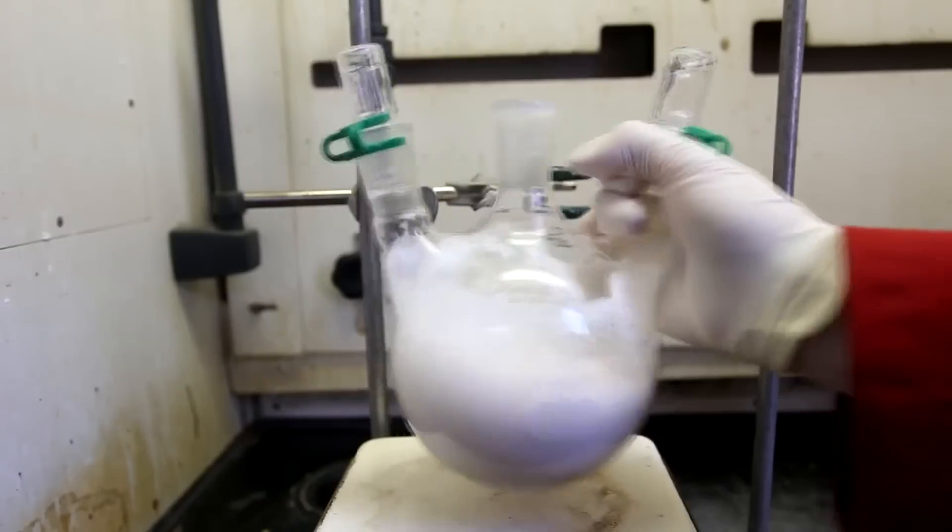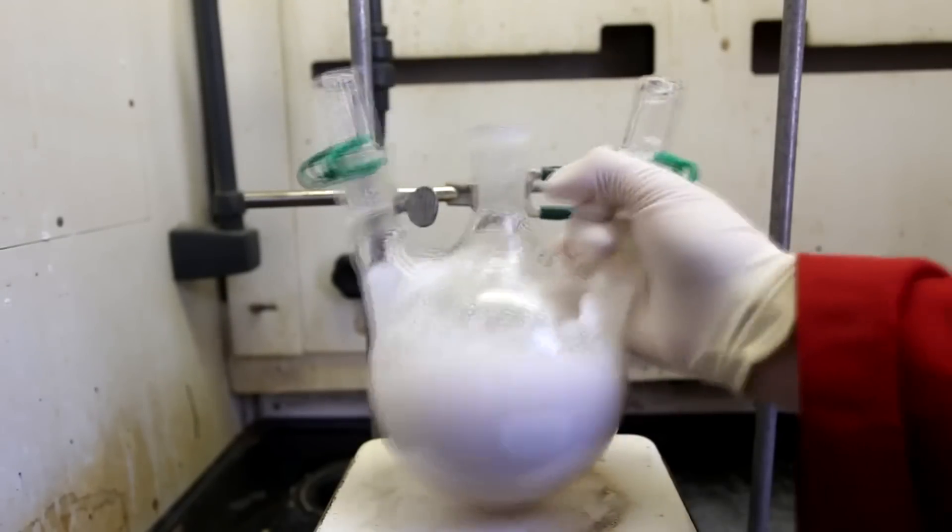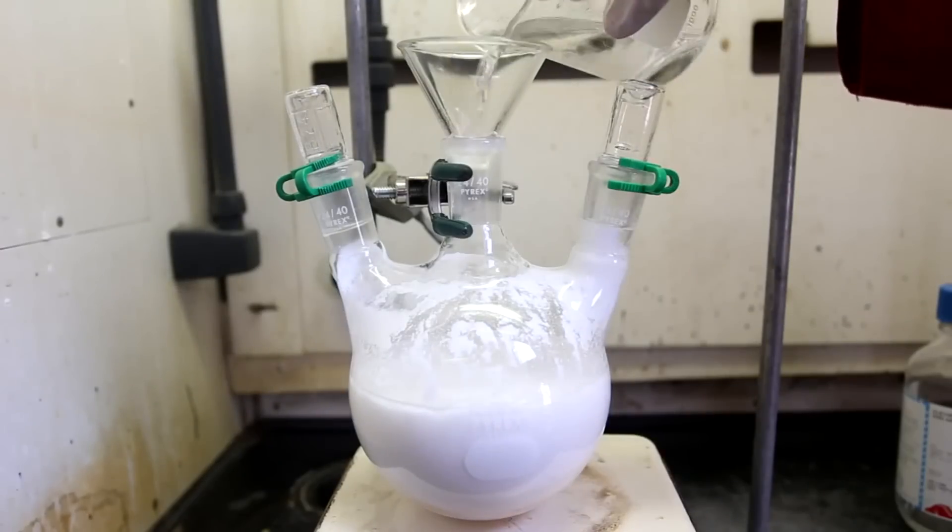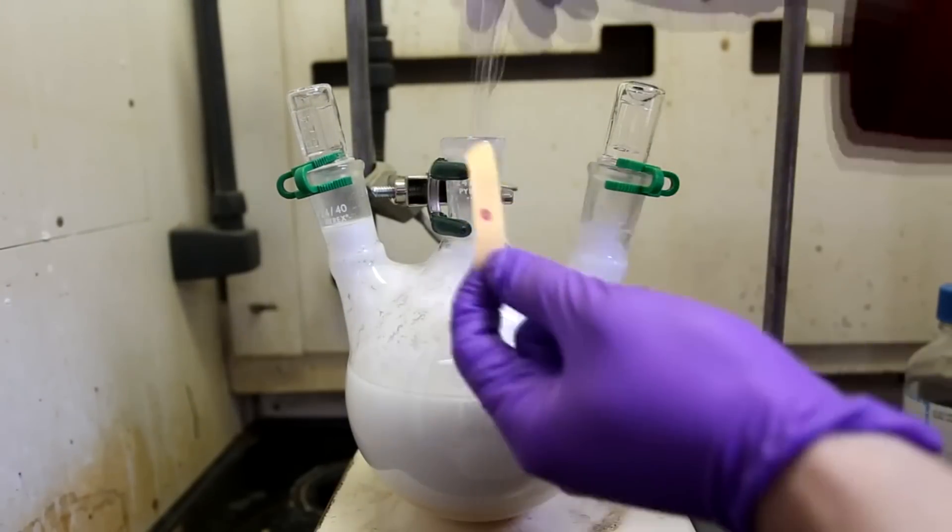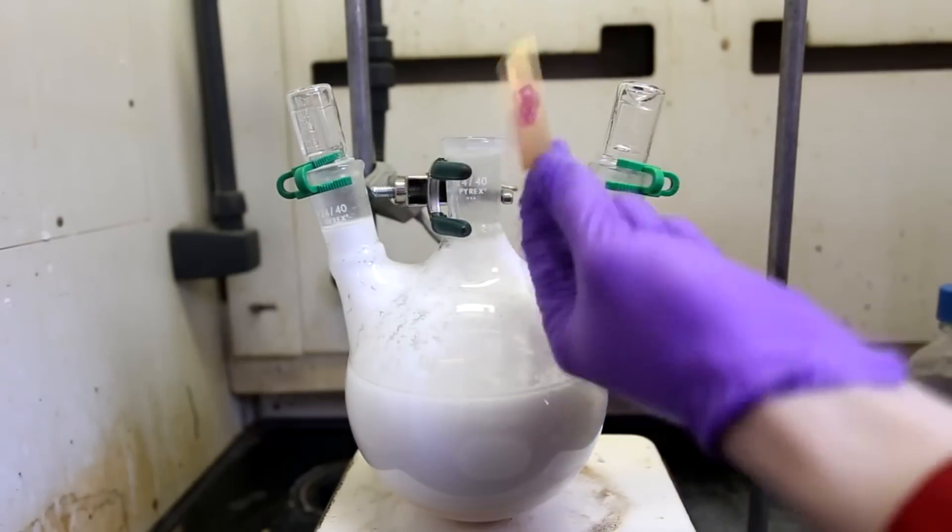The pH was checked periodically and the addition of hydrochloric acid was stopped once the pH reached about zero. By the time the pH had reached zero, the solution had become a thick sludge full of salicylic acid precipitate.